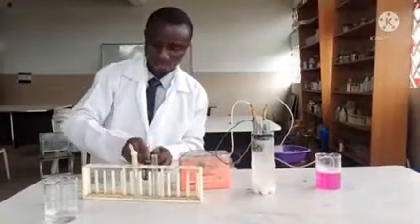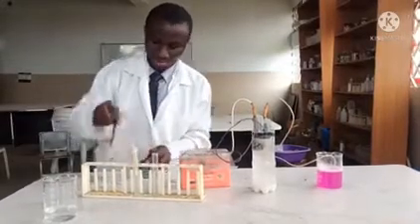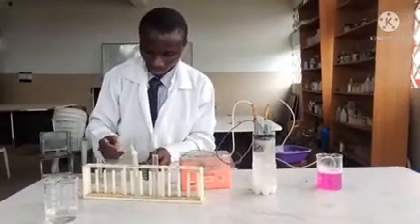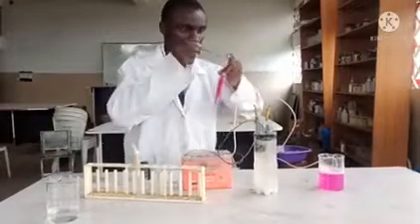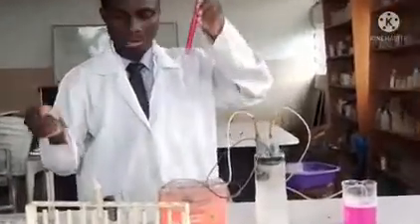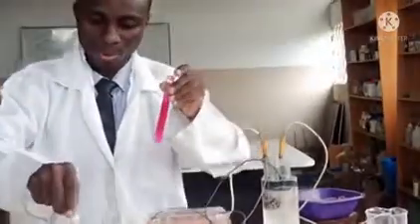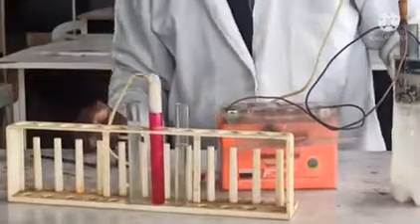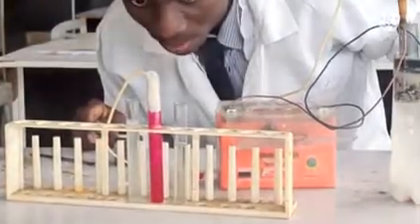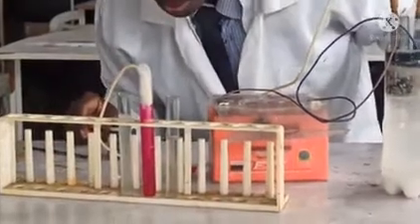I'm going to add a little more phenolphthalein to the solution. Let's see — okay, this is the pink color. And now I'm going to bubble chlorine into it to see the reaction — let's see what happens. That's the color change as the chlorine bleaches the indicator.